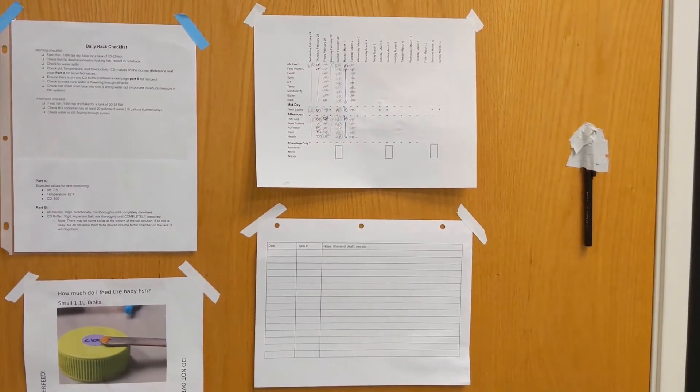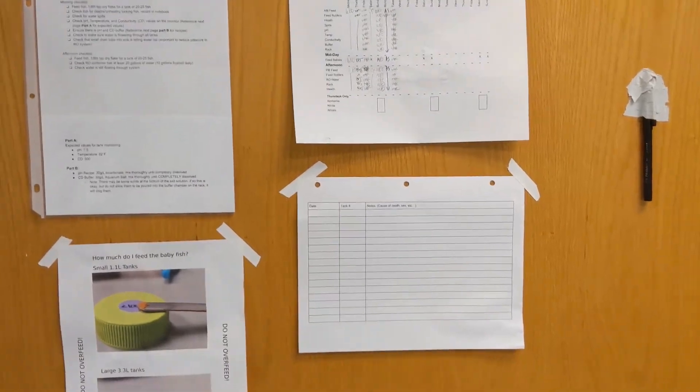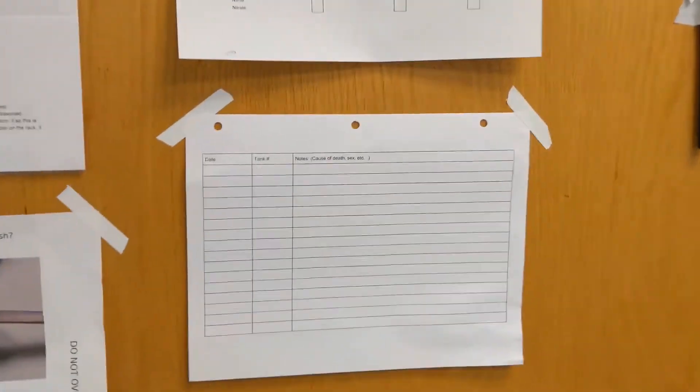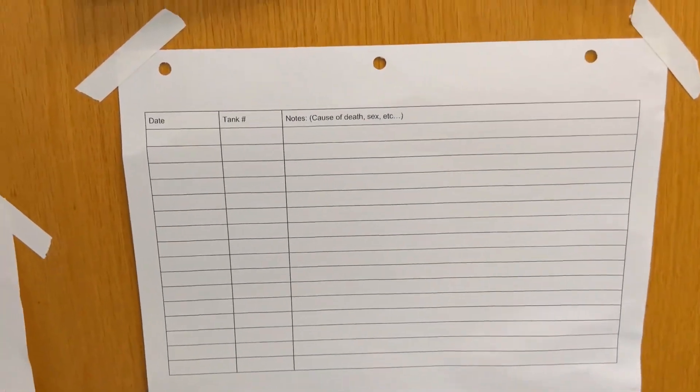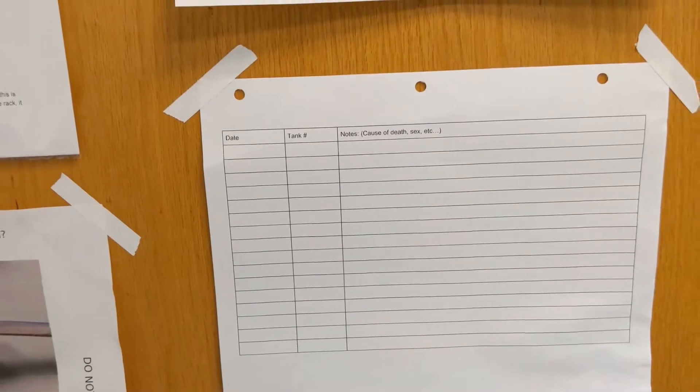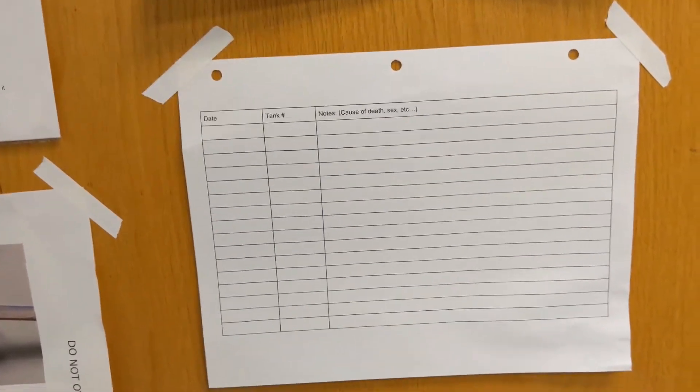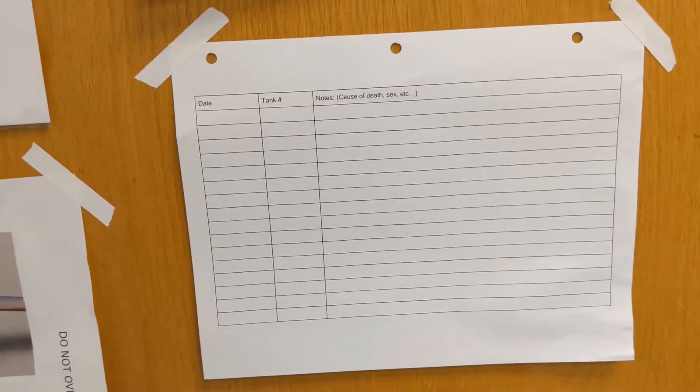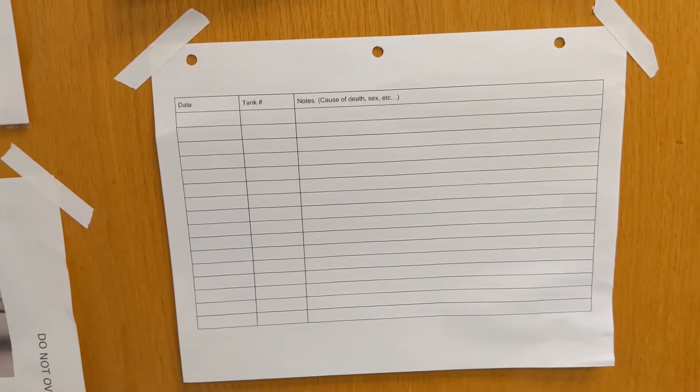Keeping track of fish health is a very important aspect of fish husbandry. Every day we take a look at all of the fish in every single tank to make sure that they don't have any illnesses or ailments.